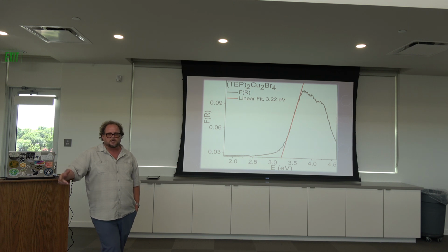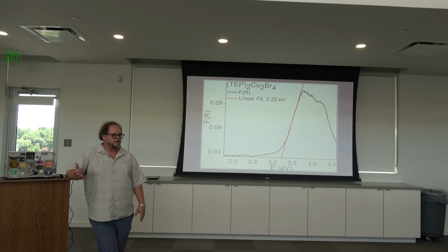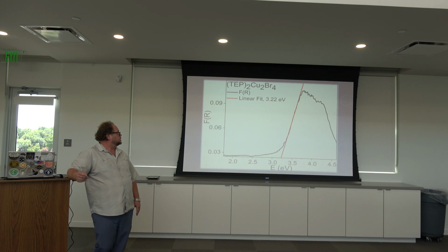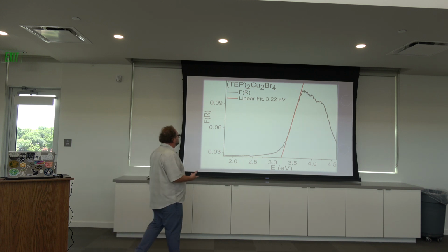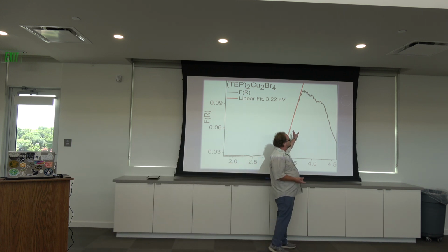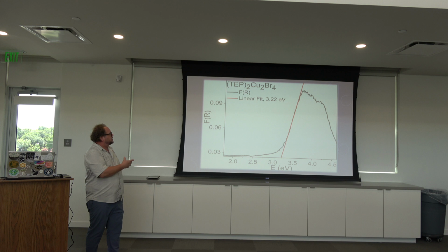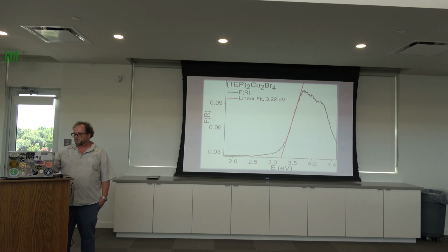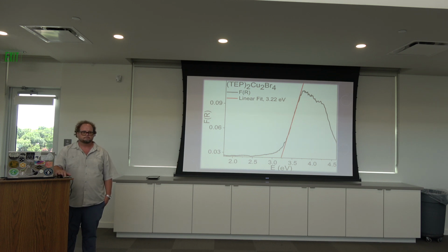Some of these solid state materials, when they become excited, their electrons essentially jump to a higher energy state. And they actually move to these higher orbitals that they wouldn't necessarily possess otherwise. And so when that happens with solids, that can mean strength, but it also tells us something about excitation here. And so this test actually does measure the band gap of this compound. So you can see where it's getting excited, and then there's this gap, and then these electrons are actually moving to this higher energy level, which has a lot to do with its photoemission properties in terms of practical uses.